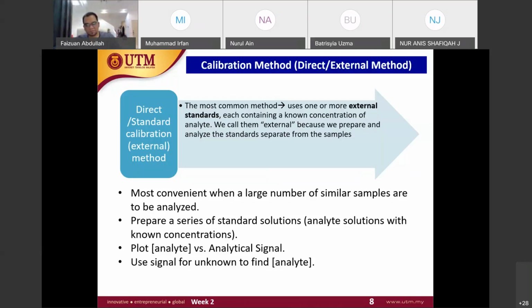So we need to teach the instrument so that they know how to measure the concentration. So we do the calibration, right? We prepare a series of standard concentrations with known concentration, increasing, right? Not similar concentrations, but with increasing concentration. And then we teach the instrument, right?